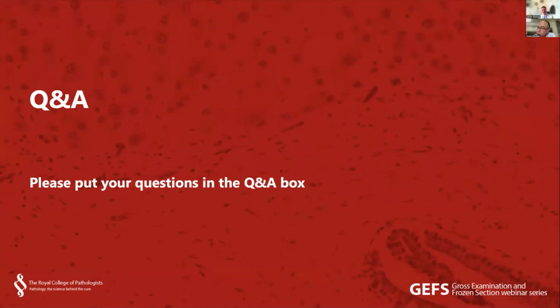Sure. Do you normally take CRM in right hemicolectomy? The distance is usually too large. Is it okay just mentioning gross distance? Is that enough? Yeah, I think that's a very good question, and you could apply that to an anterior resection or AP resection as well. I think that's very reasonable.